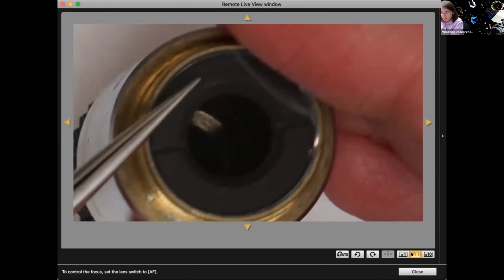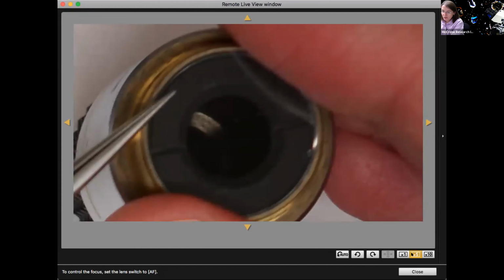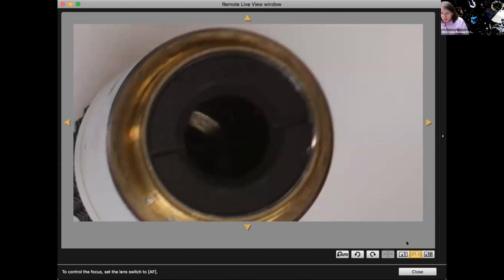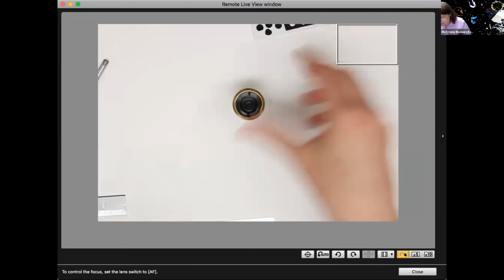You might need to roll up the piece of tape and then put the cover slip, just so that it doesn't slide off when you're trying to install it, and then you end up with a bunch of broken glass that falls inside your objective. So let me show you how to work these guys, and we'll get our tape cut and ready to go.